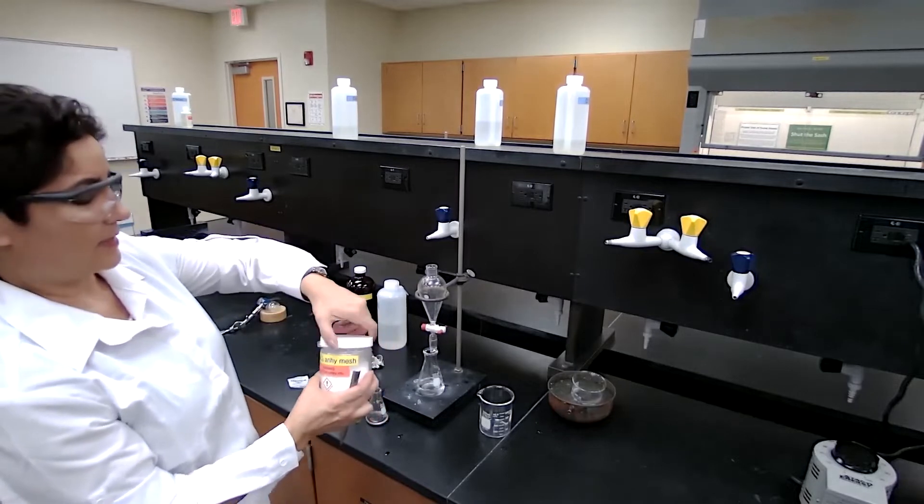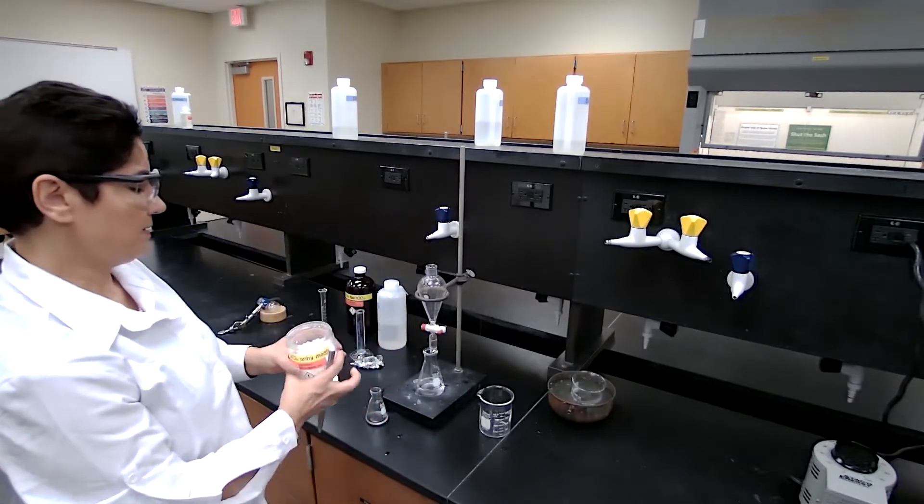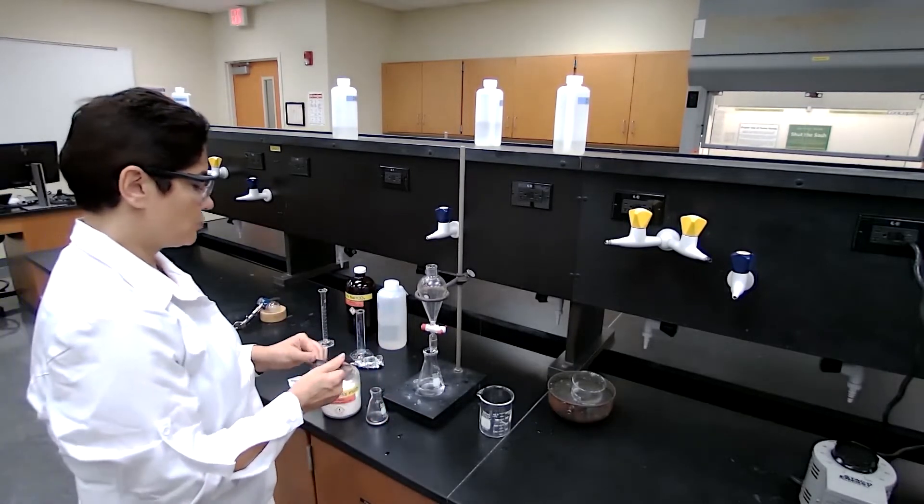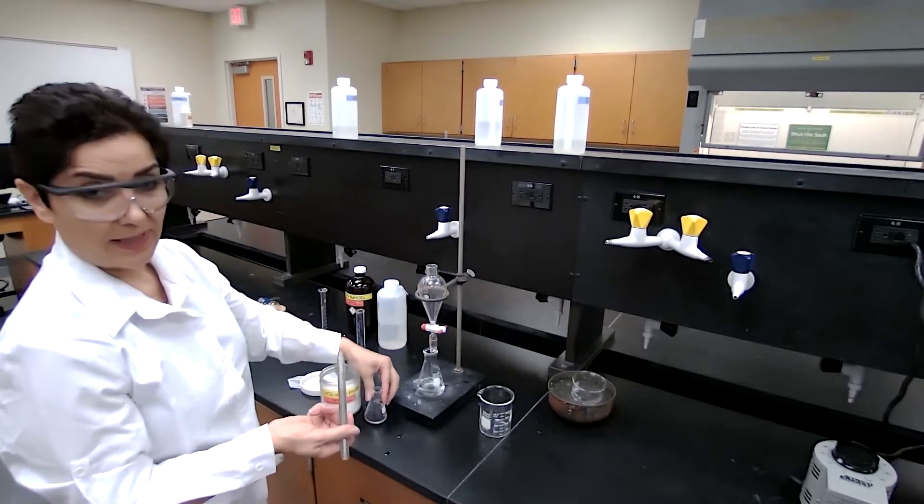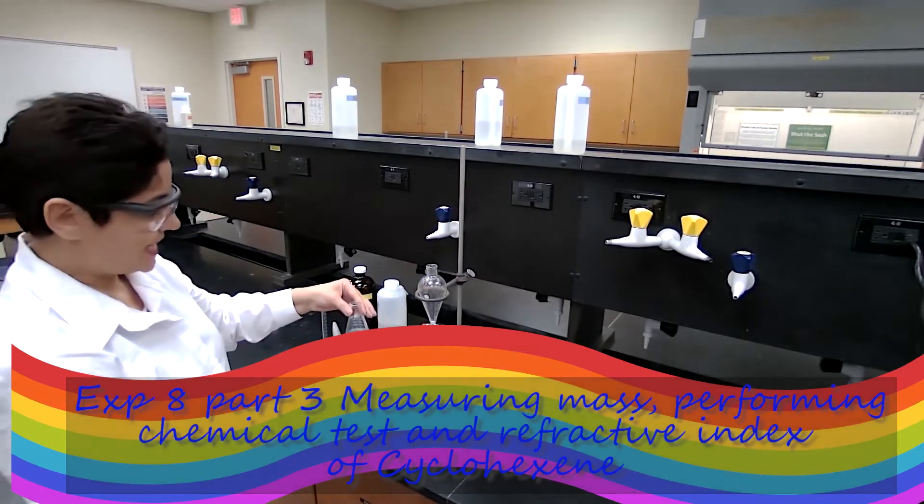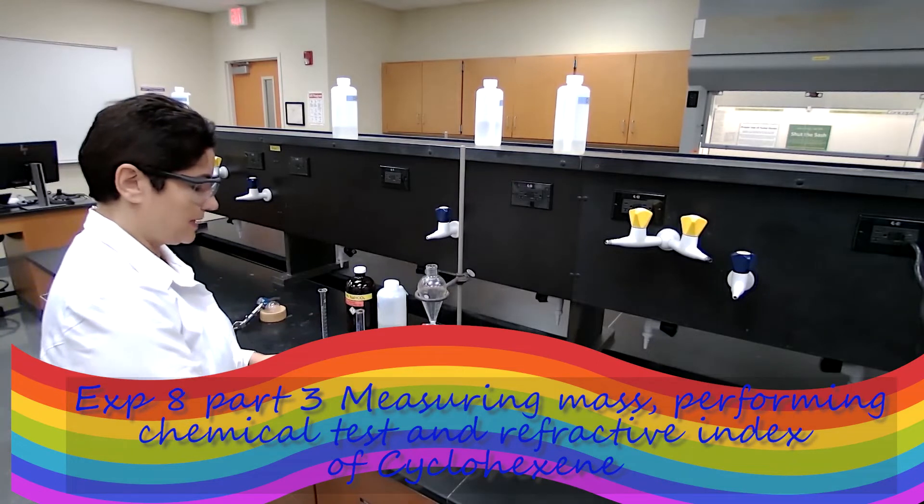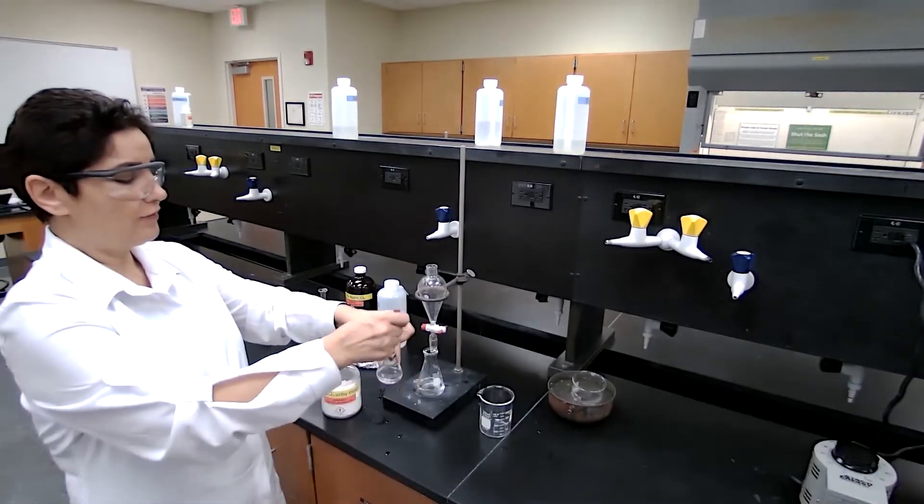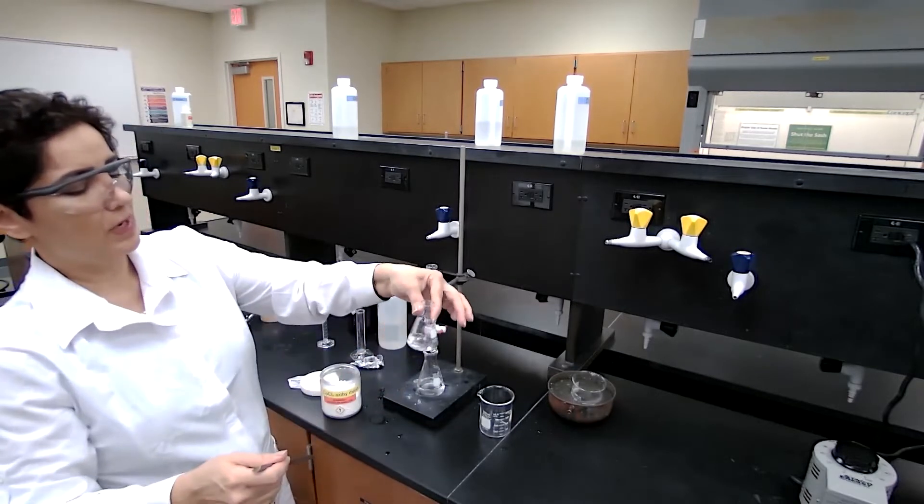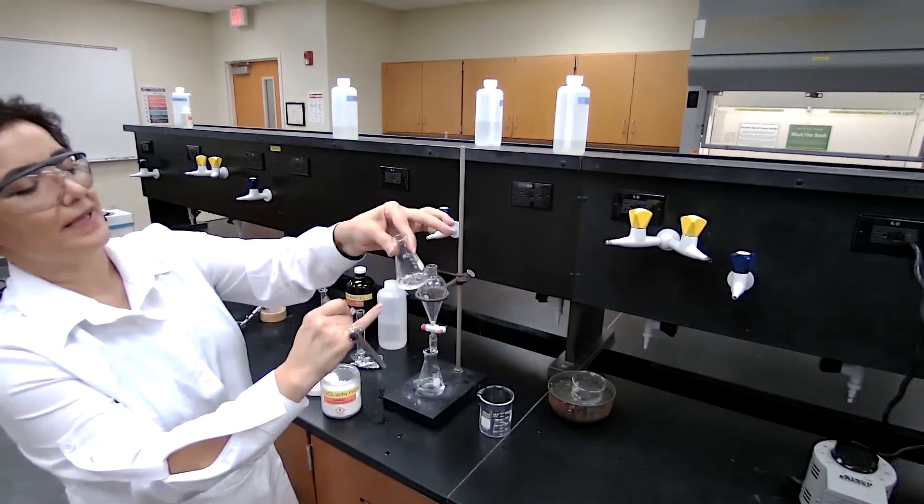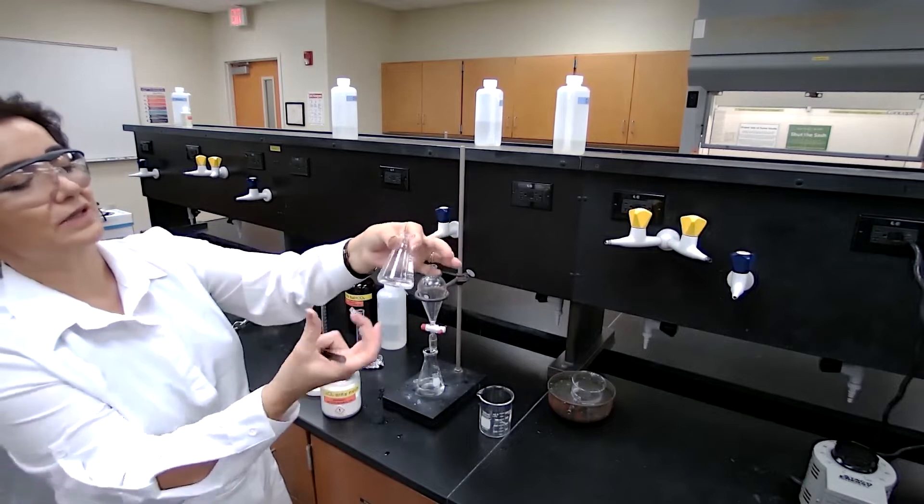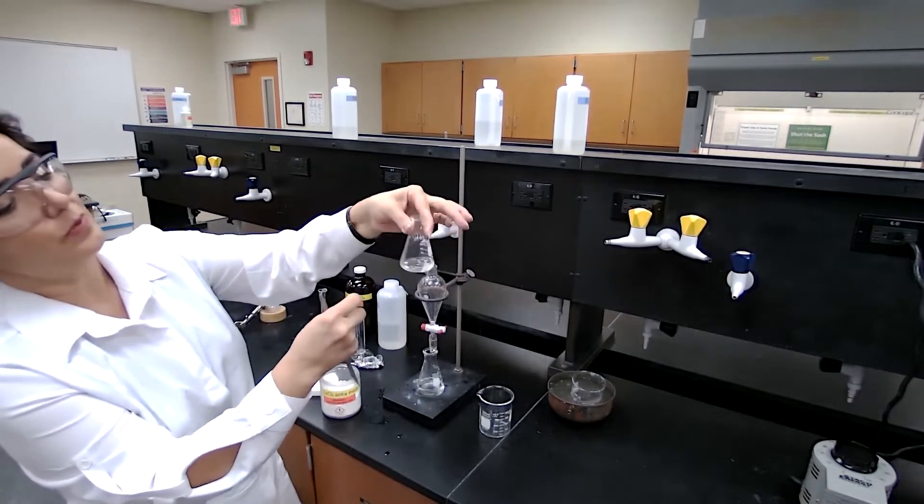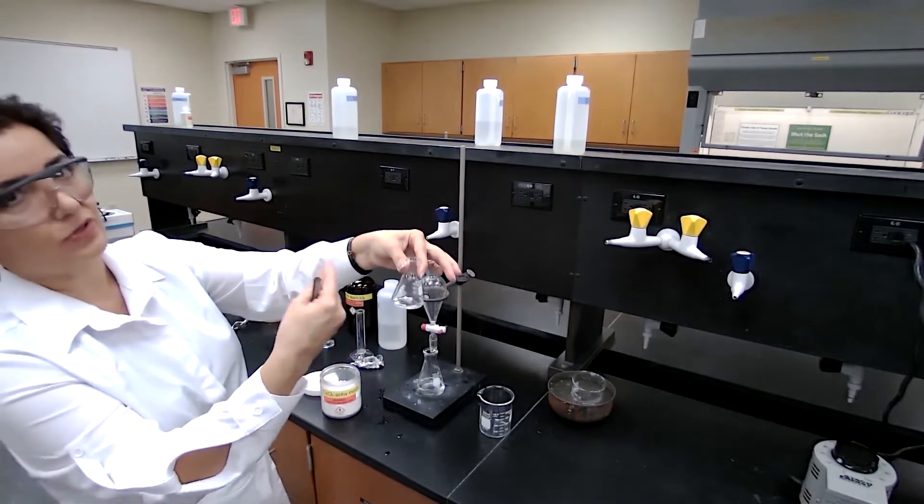Anhydrous calcium chloride is used for drying the sample, and students always ask me how much should I add. I just say add enough. How much is enough? Enough is when you add the drying agent or anhydrous agent and it doesn't clump up.